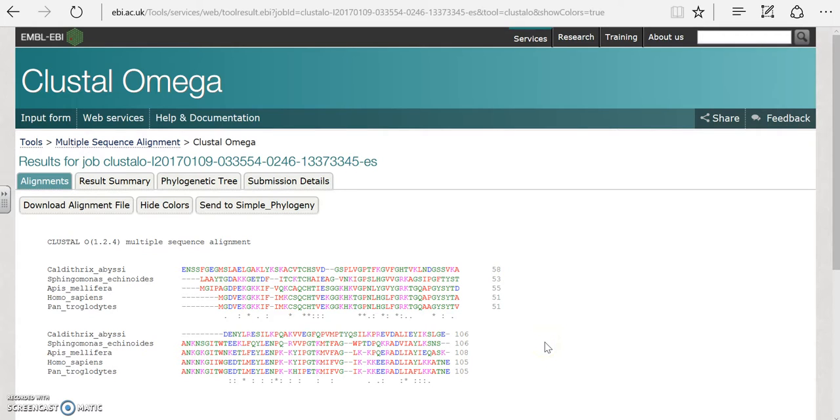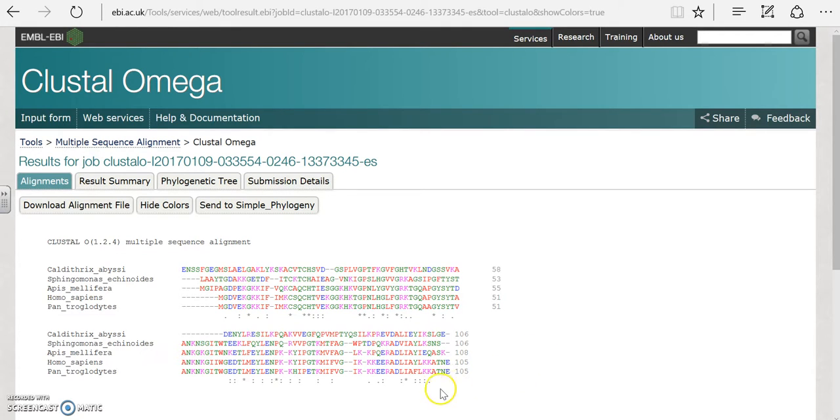With this in mind, with this data you can go ahead and look at the species and compare them visually and address the questions in exercise three. Thank you so much for joining us today.